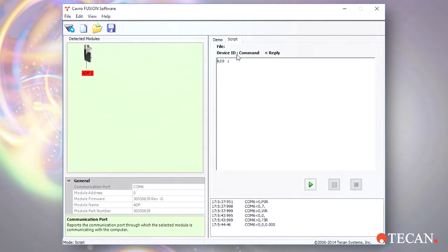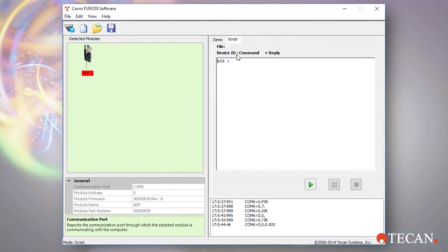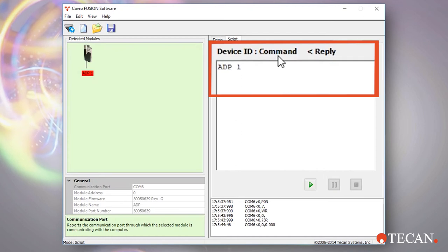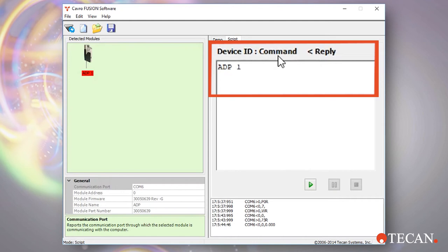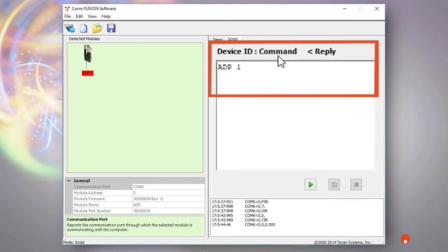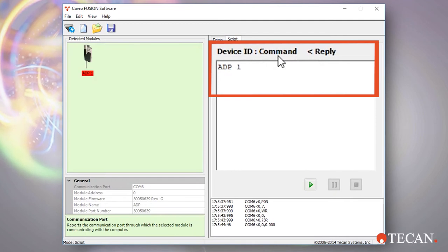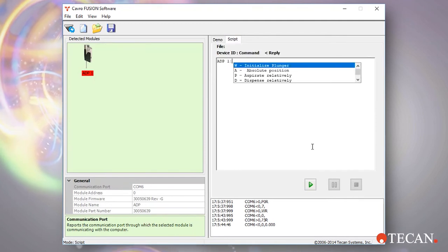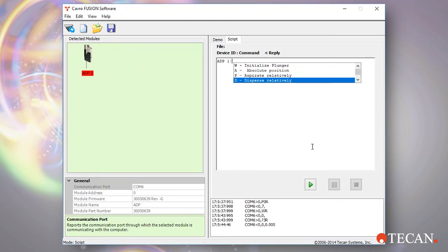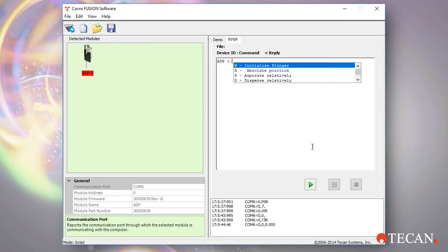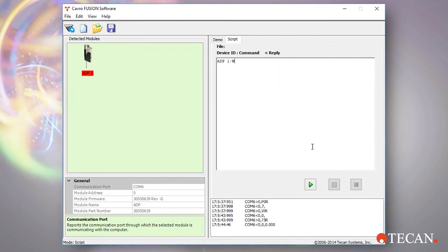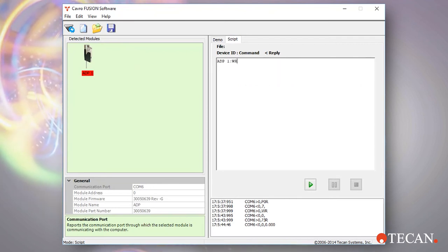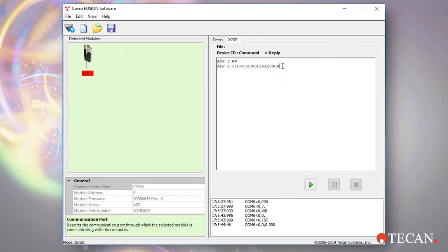In the Fusion scripting window, the pump name is displayed, usually ADP1. As shown in the text at the top of the window, the command syntax in Fusion is the device ID, followed by a colon, and then the command. Any response from the device will be displayed over to the right after a less than symbol. When you add a colon after the device name, some suggested commands may pop up to help with your programming. Either select from the suggested commands or continue typing to override. You can enter a single command or a long string of many commands together on one line.